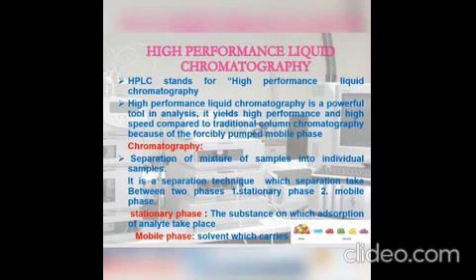Chromatography is a separation technique in which a mixture of samples is separated into individual components between the stationary phase and the mobile phase. Stationary phase means the substance on which adsorption of the analyte takes place, and mobile phase means the solvent which carries the sample. Next, liquid chromatography.